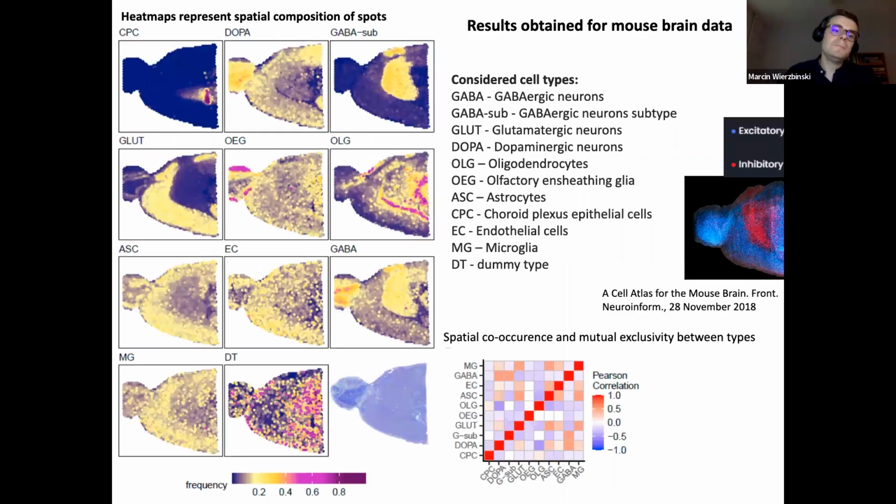Okay, and what is nice in this data set is that we don't have exact information about the decomposition within the types, but we have the biological information about the cell types, the localization of these cell types, and how many cell types we have within this ST microarray.